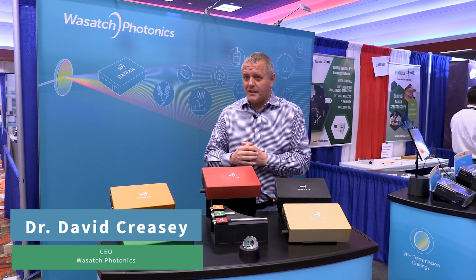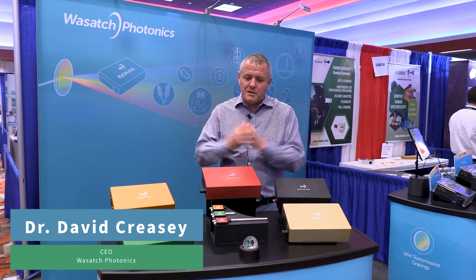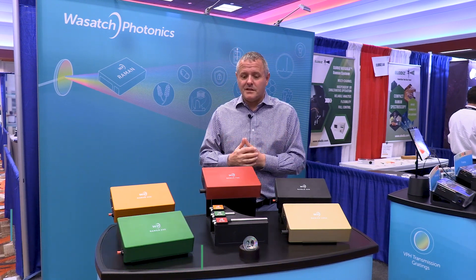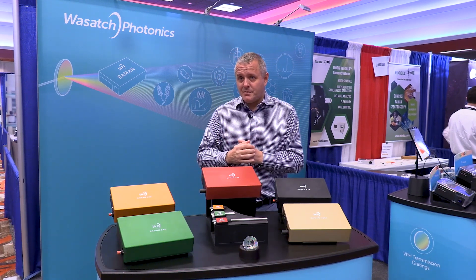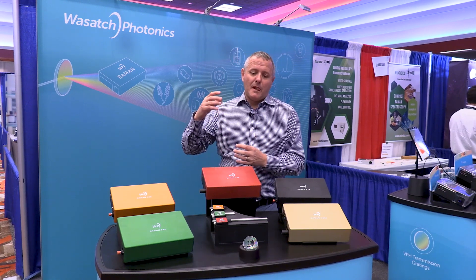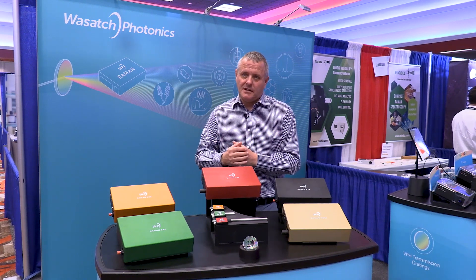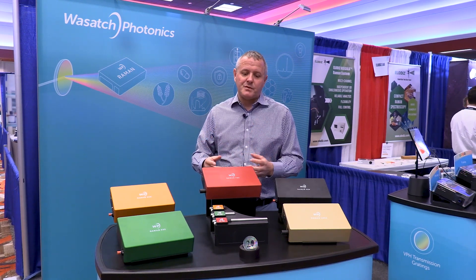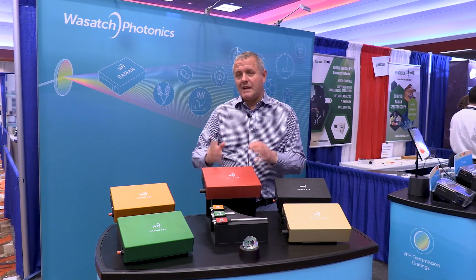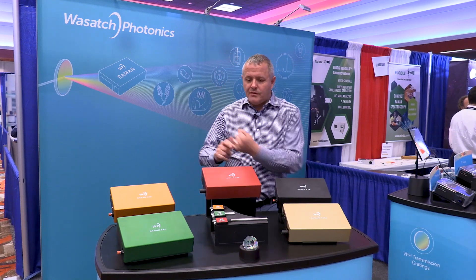Let's start with the most important one: customers. Listening to customers and being in the industry shows what they really want is a high-sensitivity spectrometer that can interface with their samples. There's a myriad of new applications — Raman is an enabling technique — and how you interface with samples and take that data requires configurability without compromising on sensitivity. That was the first thing we wanted to do.